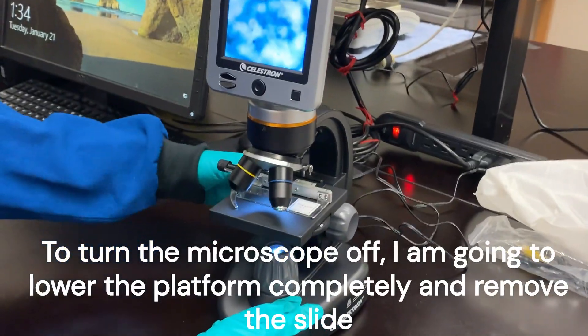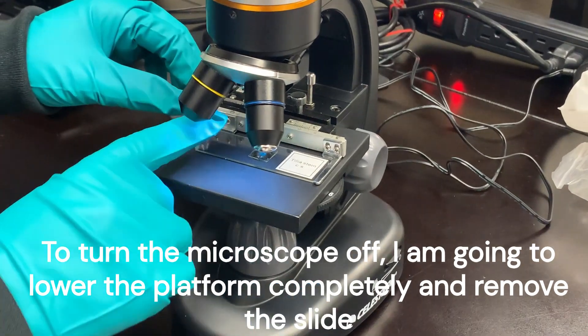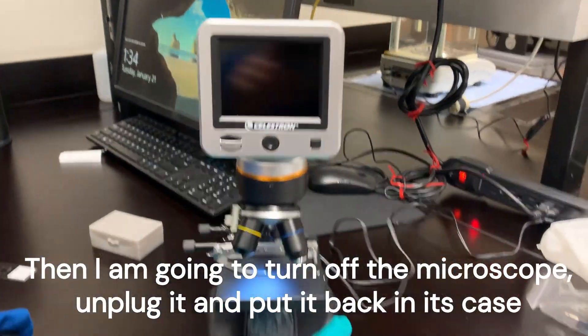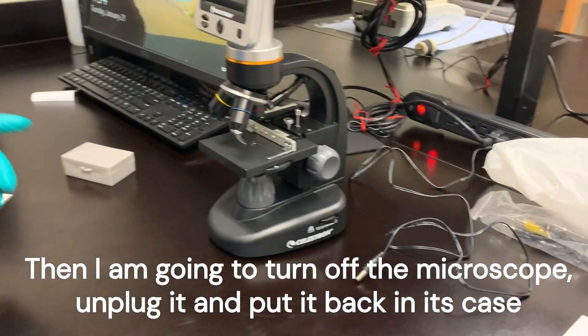When you turn the microscope off, lower the platform completely, remove the slide, and then turn off the microscope. Make sure it's completely shut off, unplug it, and then put it back in its case.